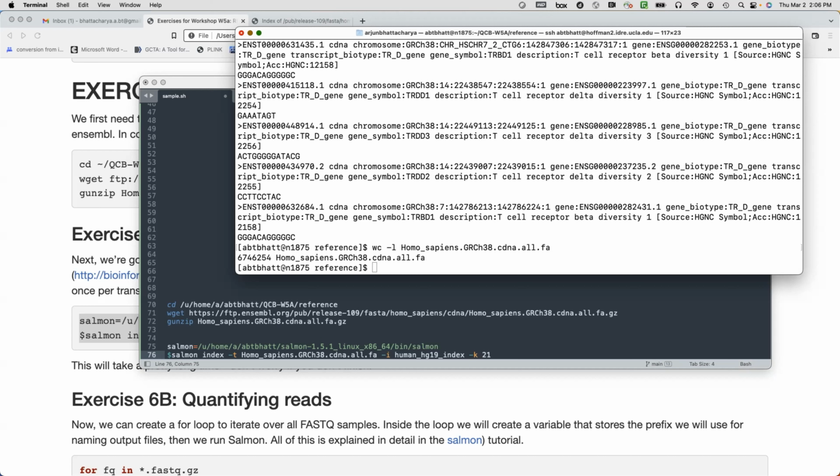This is Ensembl's catalog of known isoforms of genes. And I think a lot of the long read RNA sequencing literature cites that this is probably around 20 to 50% across different cellular contexts. So we are probably still in the range of 60 to 70% missing in terms of transcripts.